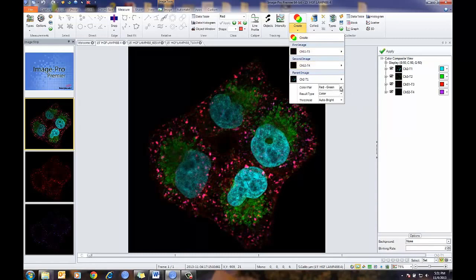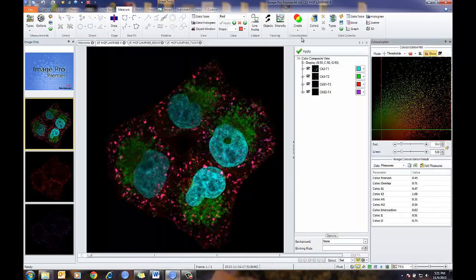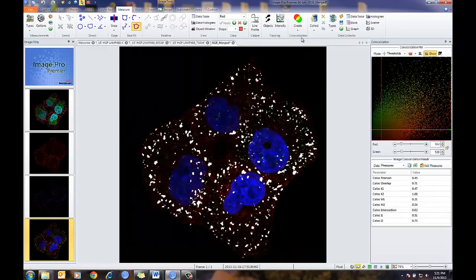Again, I have the selections, color pair, result type, and threshold. And I'm going to press create. Very similar to what we've done in the past, but now I also have a third channel, which is now going to be my parent channel. So if I want to know the colocalization values just within the area of the nuclei in this case, I can do that. And to do this, I'm going to use my threshold tool in the colocalization plot.